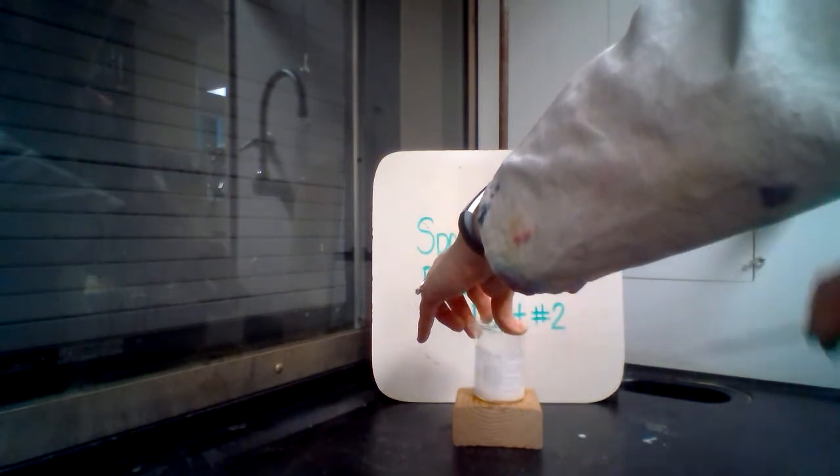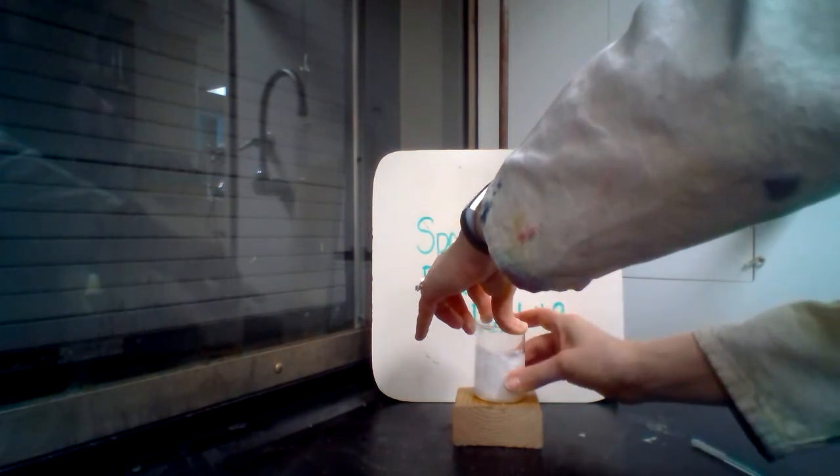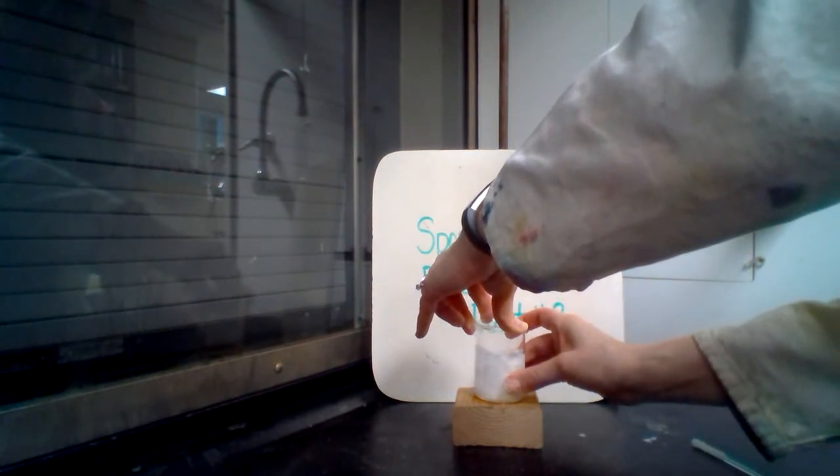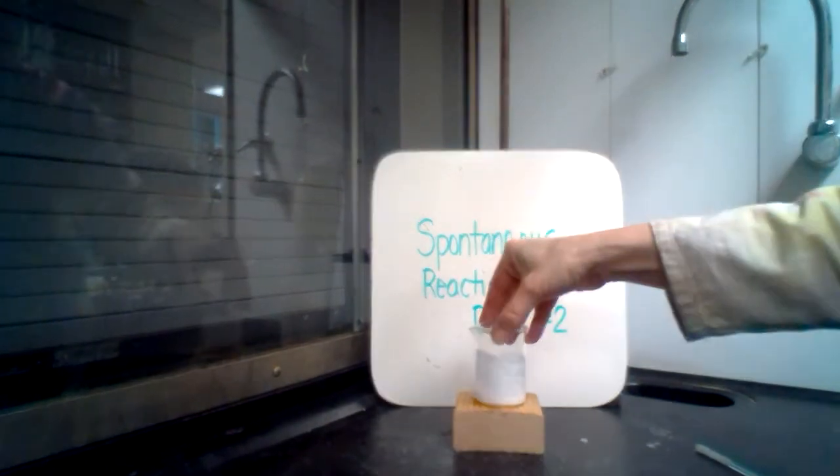Let's try this out. I want to touch this. It is cold to the touch. So you want to note that for part of your lab.